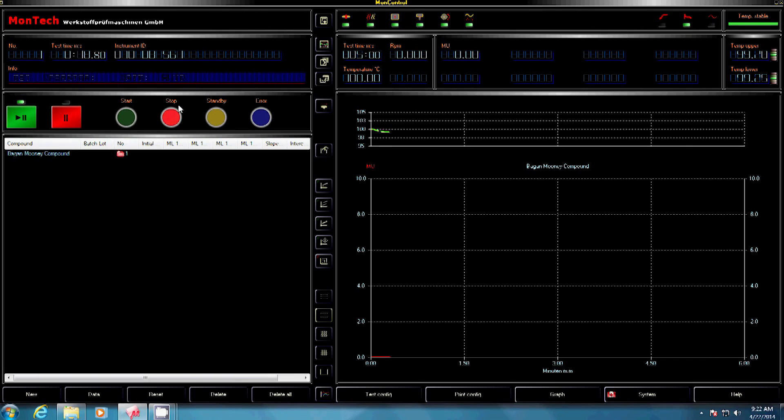During a typical Mooney viscosity test, the rotor is preheated for one minute. Afterwards, the rotor is turning at a speed of 2 rpm embedded in the material and the torque on the driveshaft is measured, converted to Mooney units and plotted on a graph of the computer.